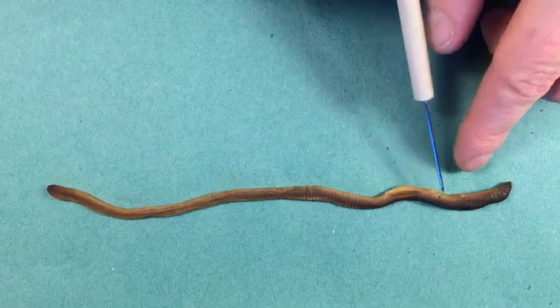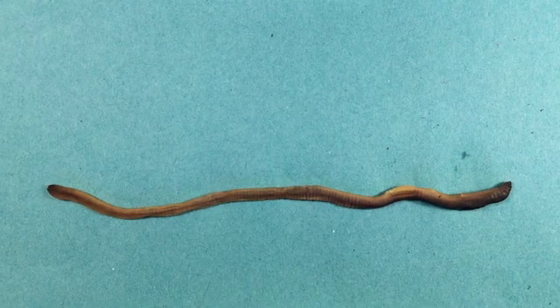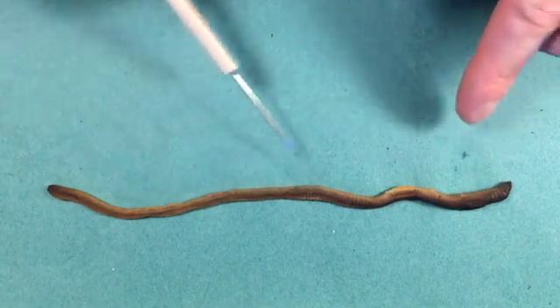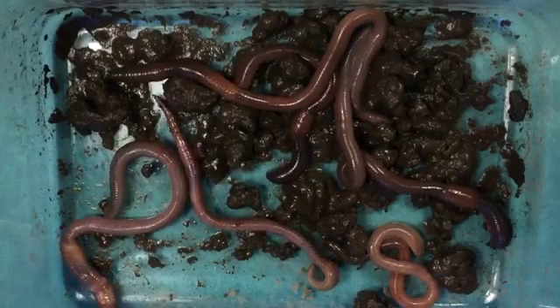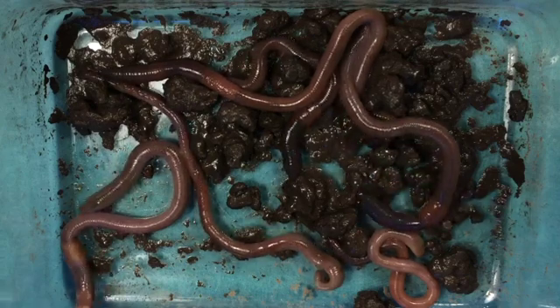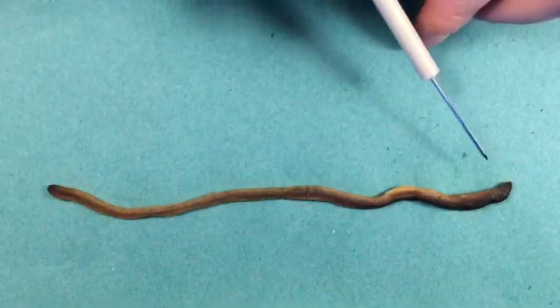The segments anterior to the clitellum do vary a little bit more, which we'll see when we open up the worm. One final thing to note before we start the dissection is the respiratory surface — this is where gas exchange takes place. Fresh specimens are quite moist because the cuticle secretes a mucus which helps keep the surface moist, and it needs to be moist so that gas exchange can occur.